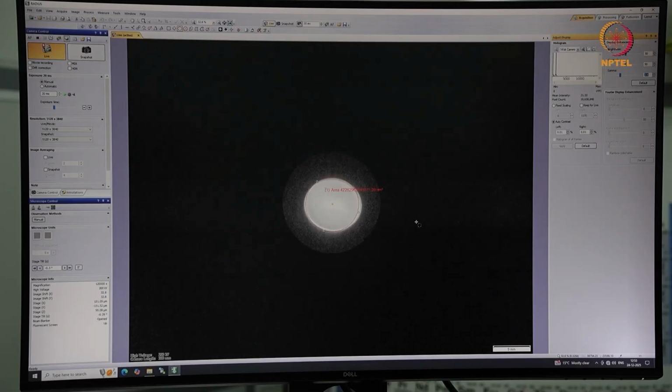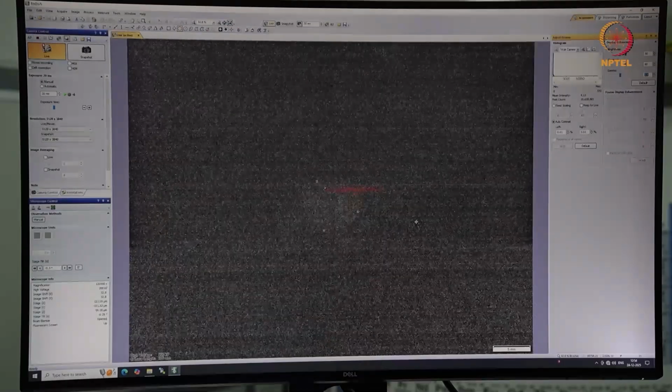So the most important thing is I have to remember to unclick the condenser stigmation knob after I've corrected for the stigmation, and I click on the PLA knob to see that the detector and the probe here are sort of centered. So once I've done this, I can lower the screen and I can start scanning from the area.